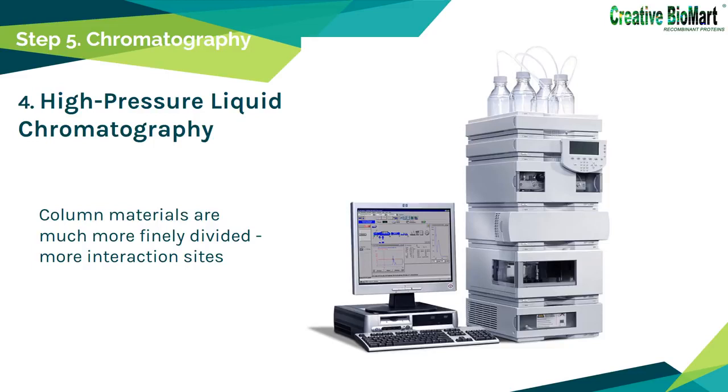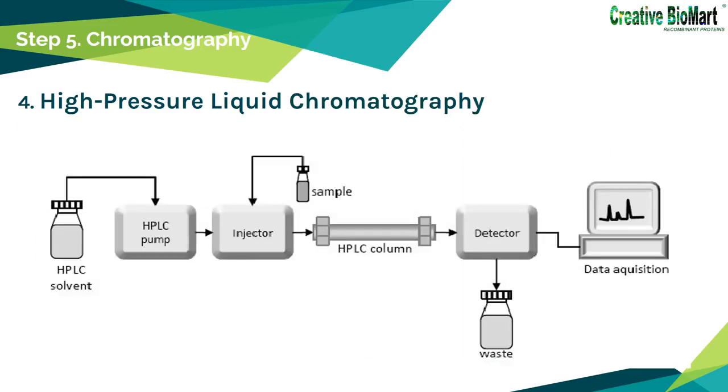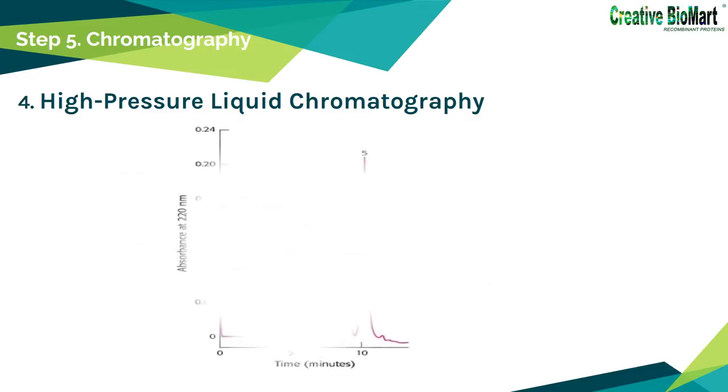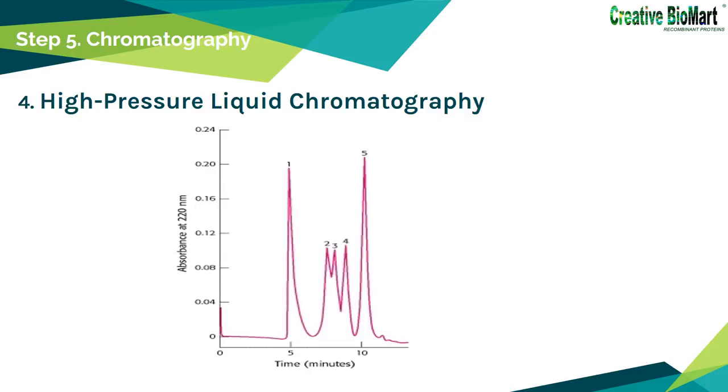greater resolving power. When using HPLC, the samples are loaded into the column and move through the stationary phase under pressure. Because different materials have different affinity with the stationary phase, the compounds leave the column at different times. The detector obtains various peak signals and each peak represents a different kind of compound. After comparative analysis of these signals, we will know the materials contained in the sample. The net result is high resolution as well as rapid separation.